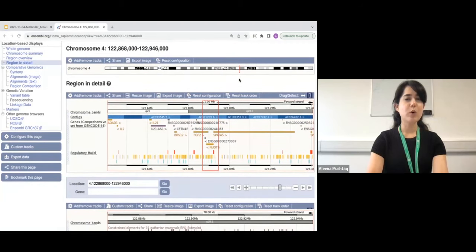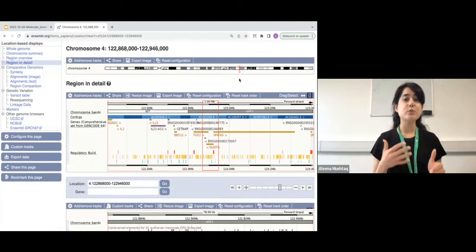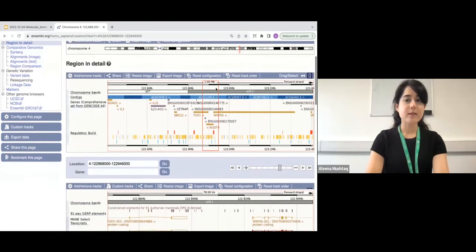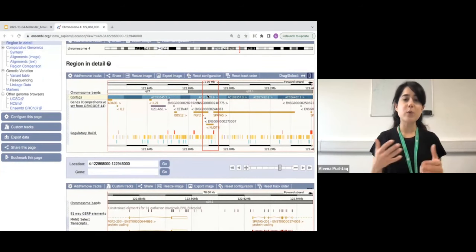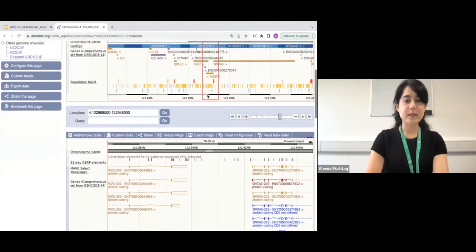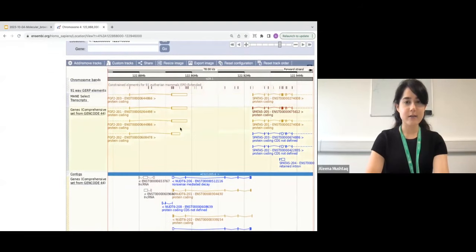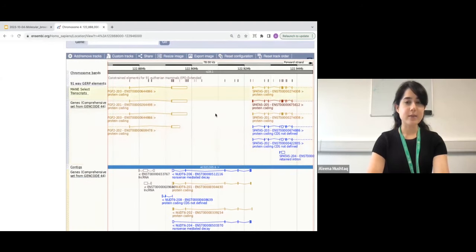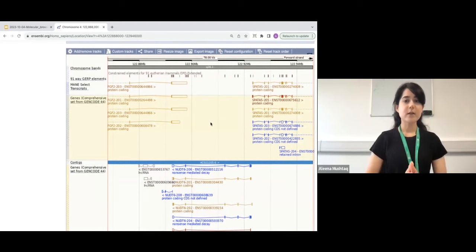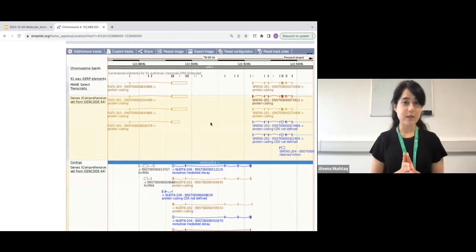Each view is a more zoomed-in version of the last. We have the chromosome view, then the region in detail view showing a bit more detail of the area searched for. Scrolling further down, we see our entire region of interest, and you can see some transcripts overlapping this region. By default, we don't show all of the information — as the page would take a long time to load — but you do have the option to configure the page using 'Configure This Page' on the left-hand side.